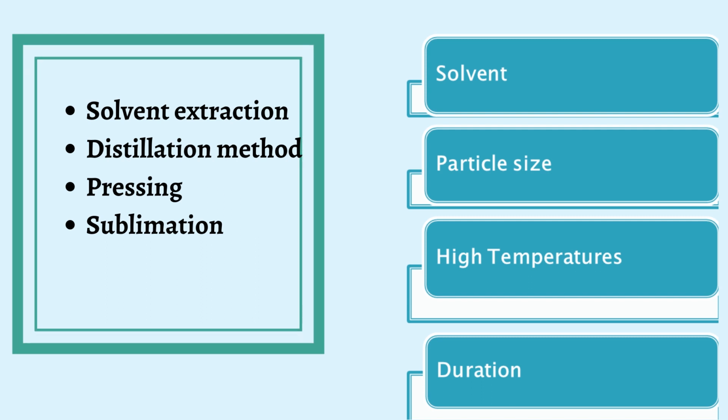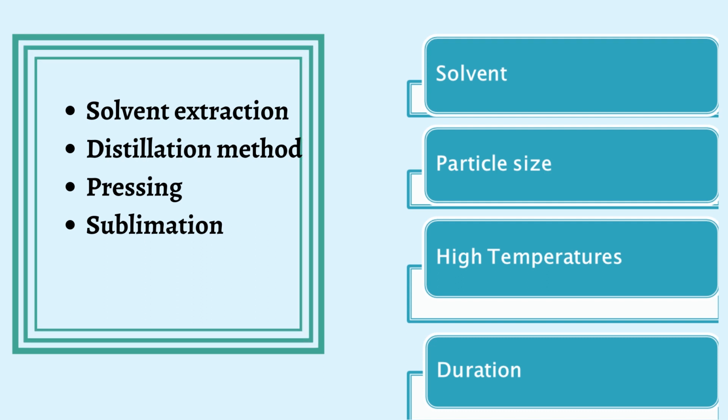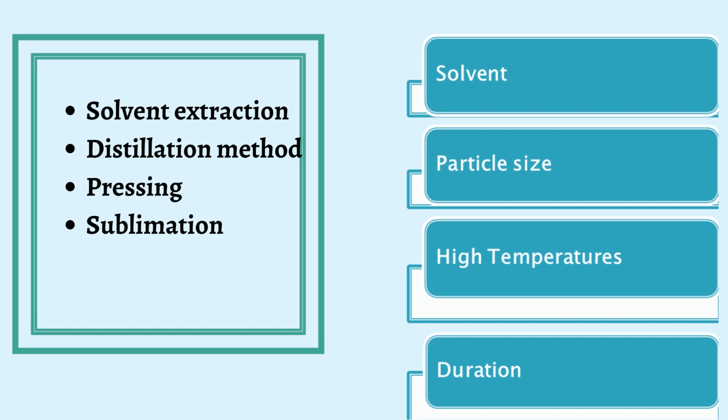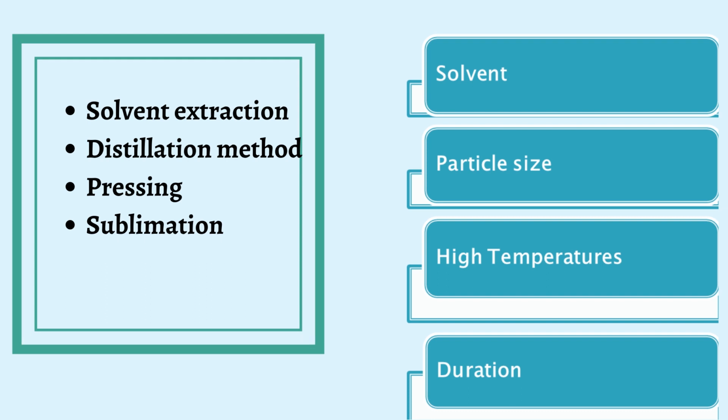The next parameter is particle size. Generally, the finer the particle size, the better the result the extraction achieves. The extraction efficiency will be enhanced by small particle size due to the enhanced penetration of the solvents and diffusion of solutes. But too fine a particle size, however, will cause excessive absorption of solute in the solid, and that is difficult in subsequent filtration.